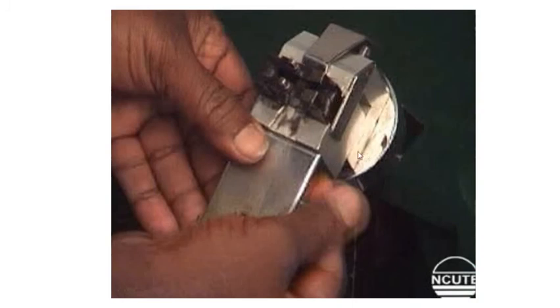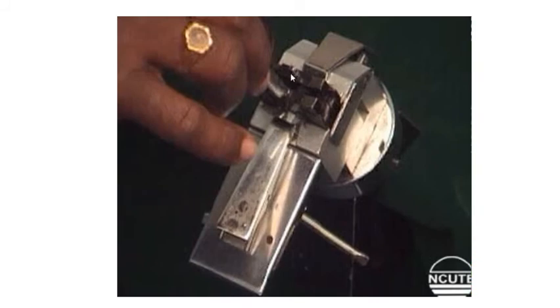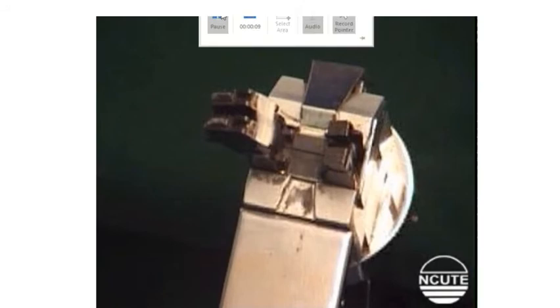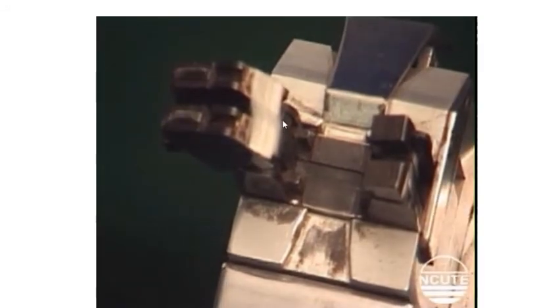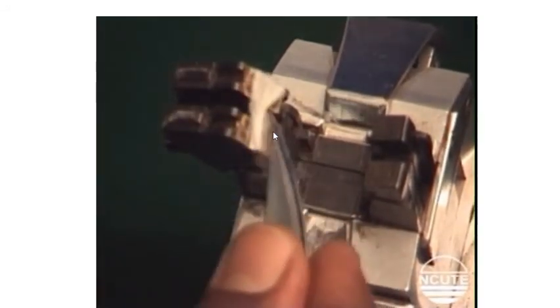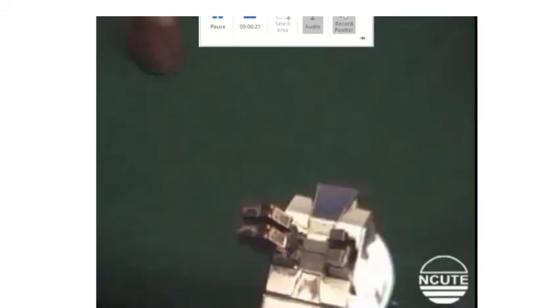Place the jaw holders in the sample preparation area. Loosen the nut as it was tightened. After unscrewing the fiber clamps, you can see the fibers here on the jaws. Here you can see those fibers. These fibers have to be removed and weighed. See, you have the forceps for removing the fibers.